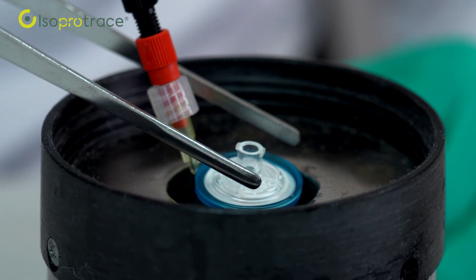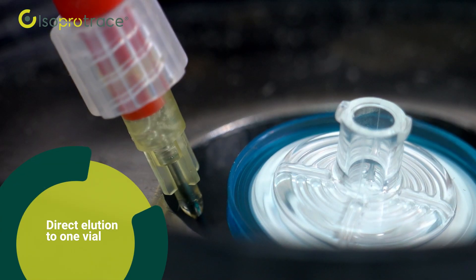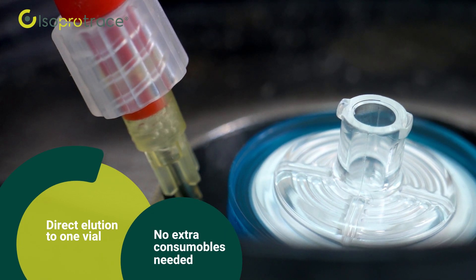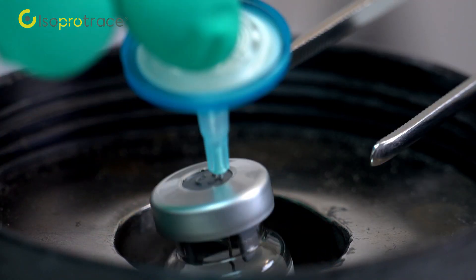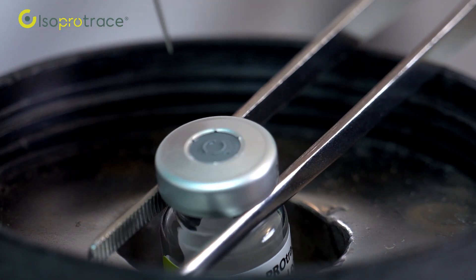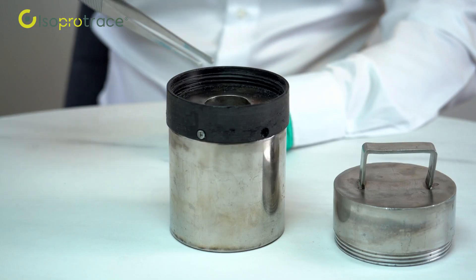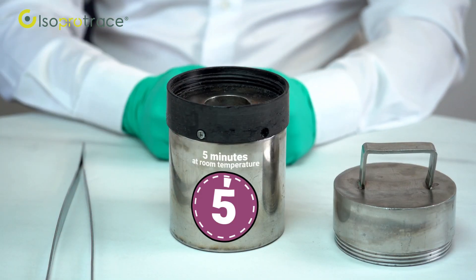Place the vial in a suitable shield. Elute the generator according to the manufacturer instructions directly into the vial. Disconnect the needle or plastic spike and shake the vial in order to dissolve its contents. Let the vial stand for 5 minutes at room temperature.